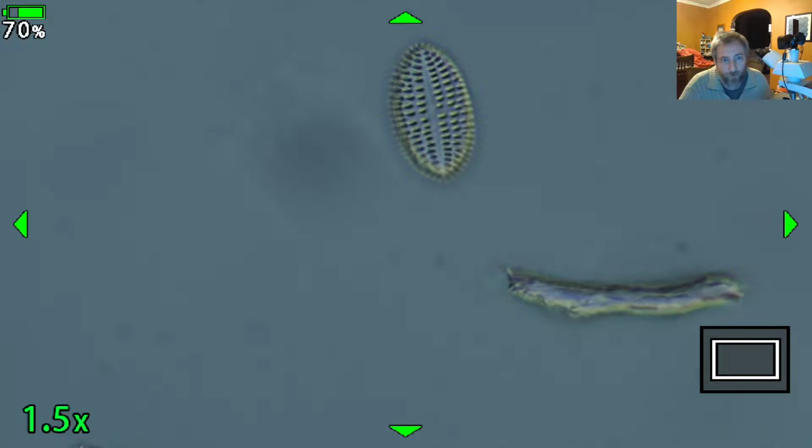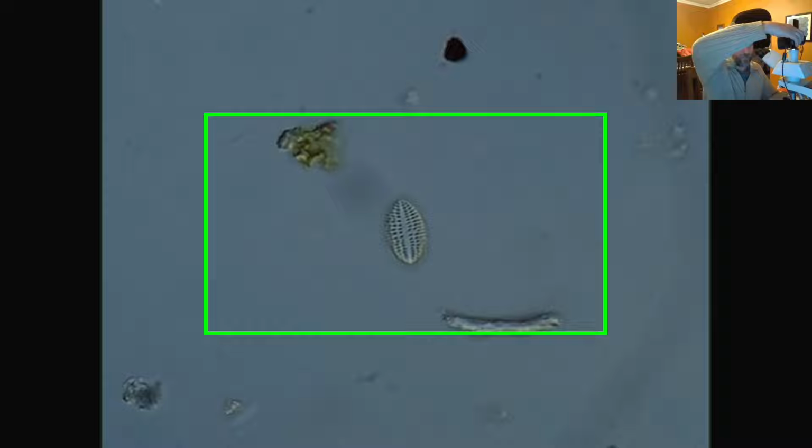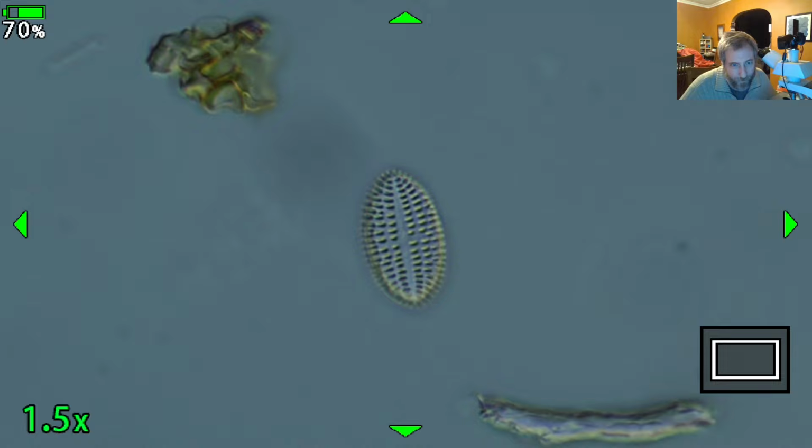But if I could use the fine controls on the microscope without it being too jerky, I'd put it in the middle, and then if we really wanted to see a zoomed in version, we could get up real close and get in its face. So you can see the areolae on these are pretty neat. I'm just magnifying the image. We're not actually making it any better. Even zoomed out, I think it's got a pretty good picture of what that thing is.